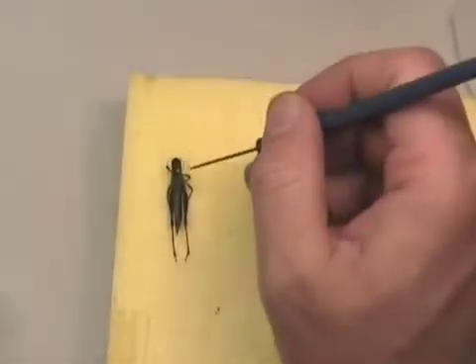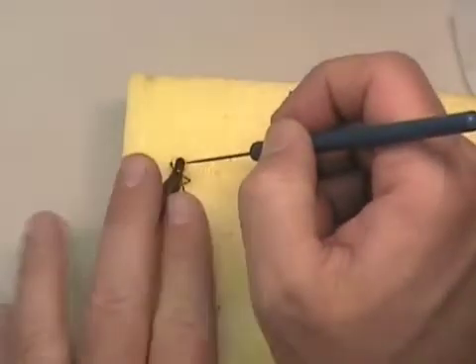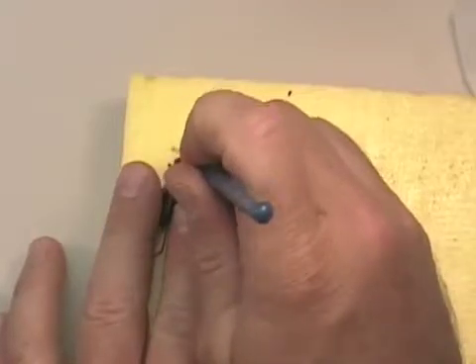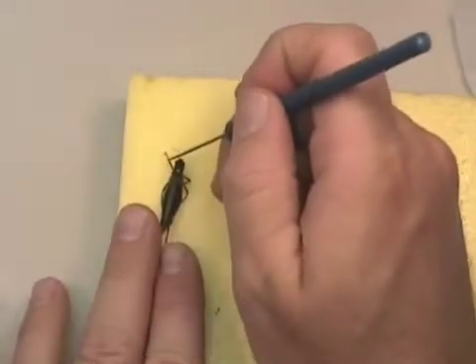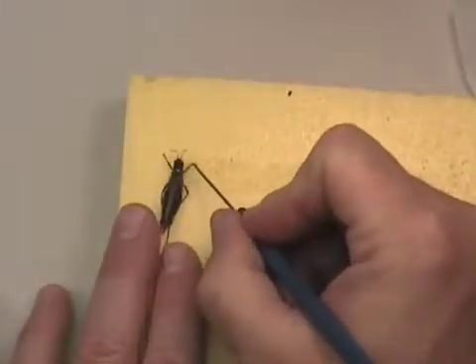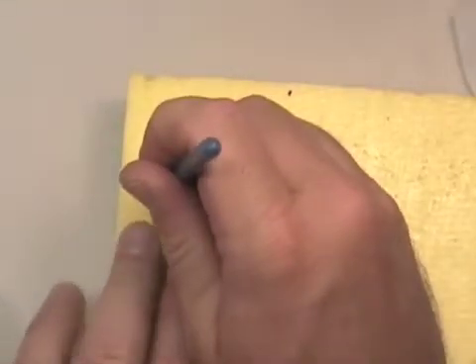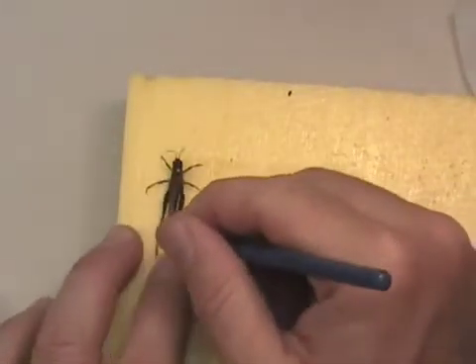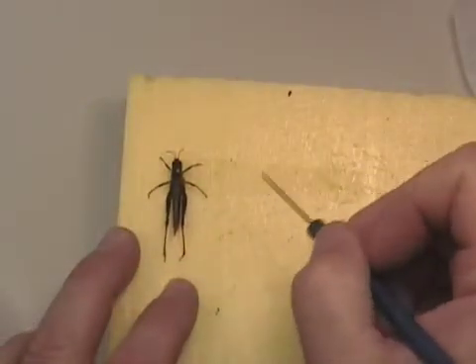We can then use a pointed probe to start to position the antennae and the legs so that it would be easier to see the various tarsal segments on the ends of each leg. If you leave them all tucked underneath, as occurs in most dead insects, it's going to be very difficult to see. It's much nicer to look at an insect that has the legs nicely spread and looks kind of natural.